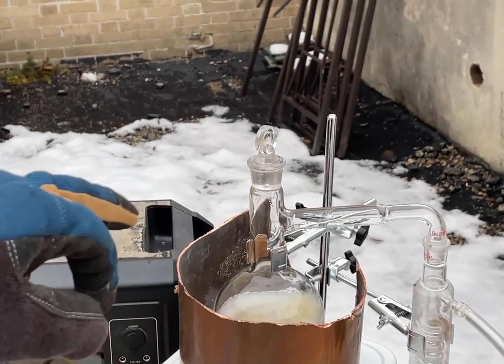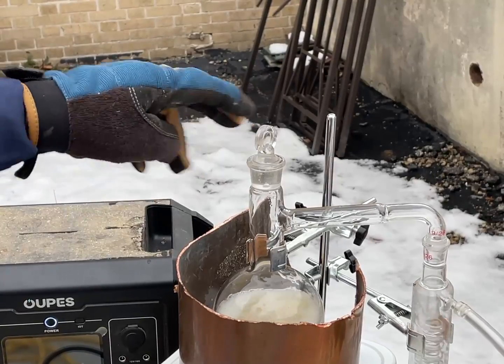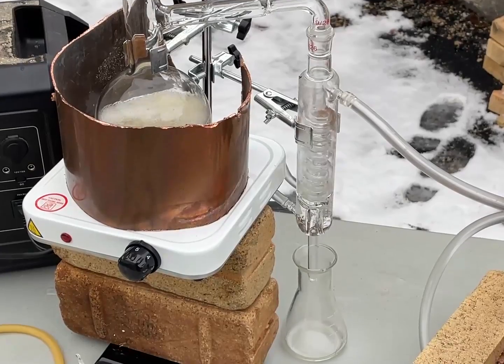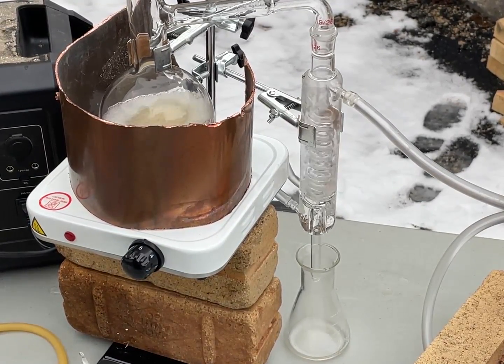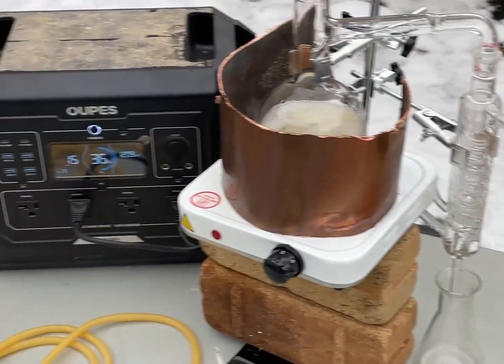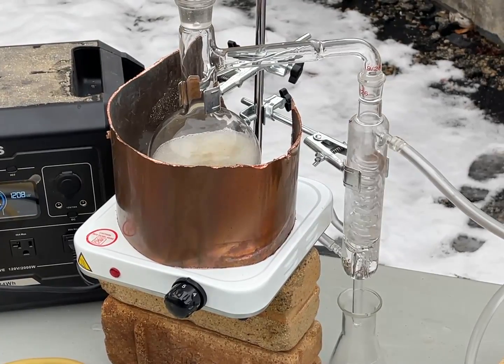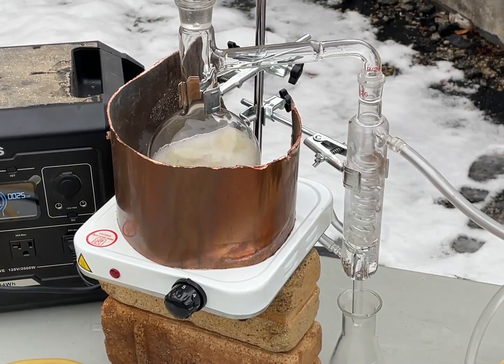It's interesting that this plug, the surface around it, the ground glass, has completely filled up with mineral spirits. Almost making a seal. I saw it wick around. We're only at 37% power though. Oh well. Hopefully we're mostly there. And those mineral spirits look nice too. I need to go get a media bottle so I can put it in there. Oh wow.